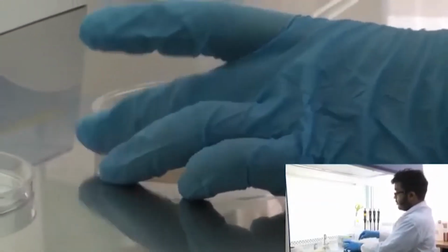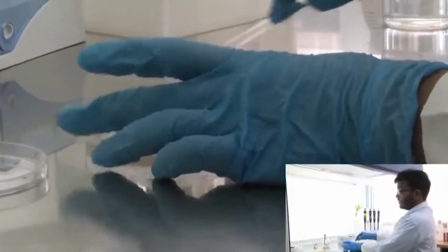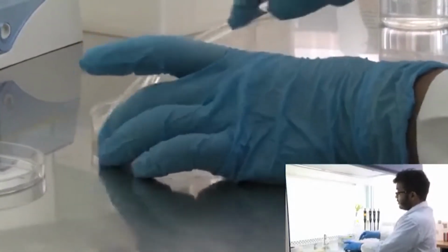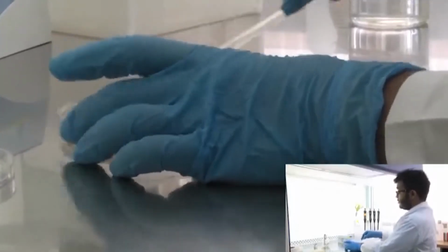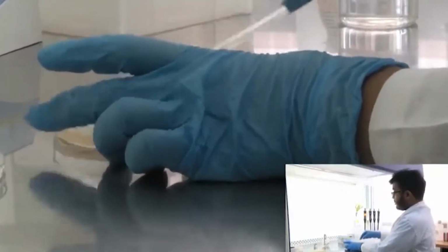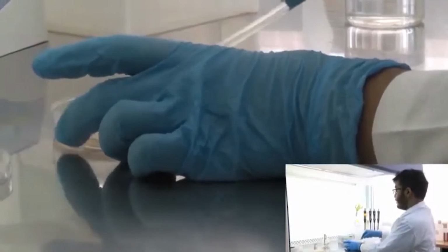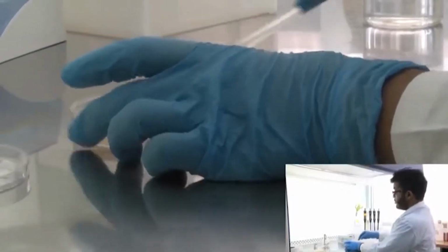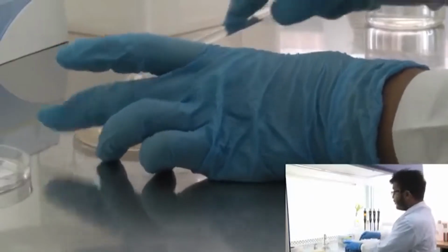I'm moving the spreader up and down, and with my other hand I am rotating the plate so that the 200 microliter culture gets evenly spread across the entire surface of the plate. So when do you stop? 200 microliters is quite a large amount of culture. Initially when you start spreading, it will feel very slippery.